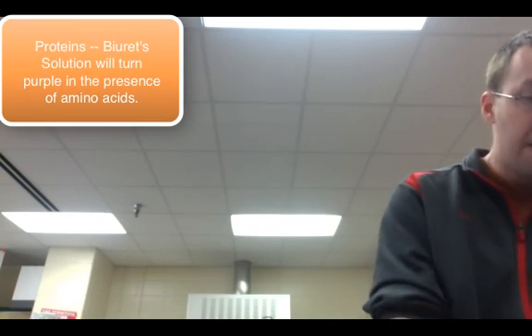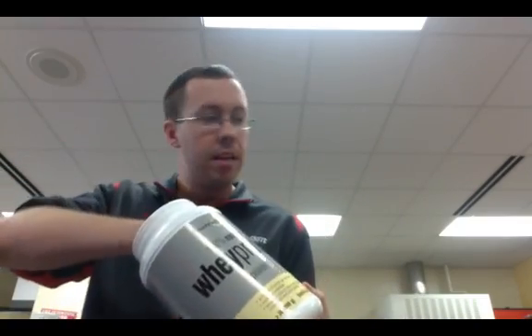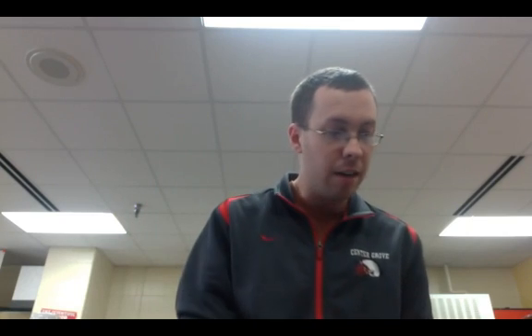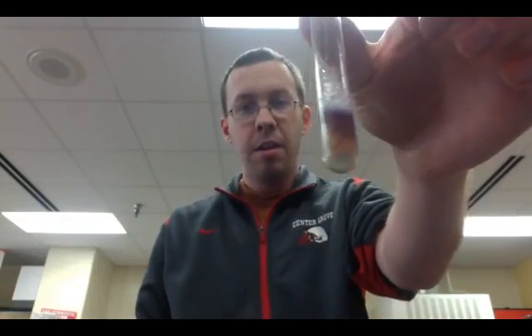The last one we want to look at is a test for protein. The test for protein involves the biuret solution — it's a way to test for amino acids. I'm going to use some whey protein — I wonder if this has protein in it. We're going to put a little bit of that into a test tube. The biuret solution is a light blue color and it will turn a violet or lavender color in the presence of protein. And right there you can see this nice purple, violet color — that tells me that is a positive test for protein.